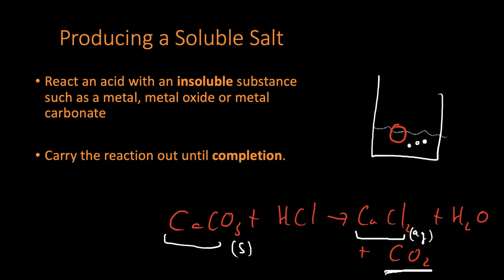So you're going to get bubbling of the gas as your calcium carbonate disappears. And then boom, that is completion. Once it's gone and the bubbling stops, that's completion, and we know that all the calcium carbonate has turned into calcium chloride, water, and carbon dioxide. That's what we mean by completion.